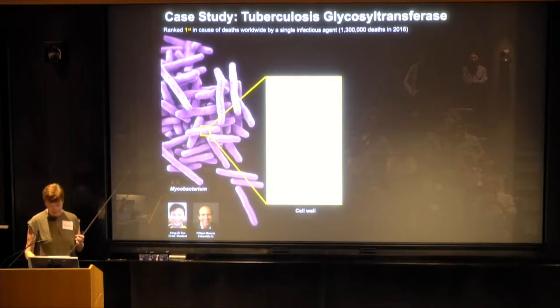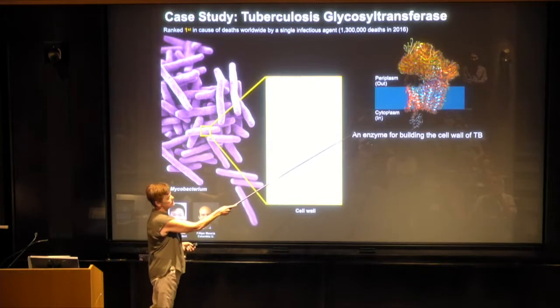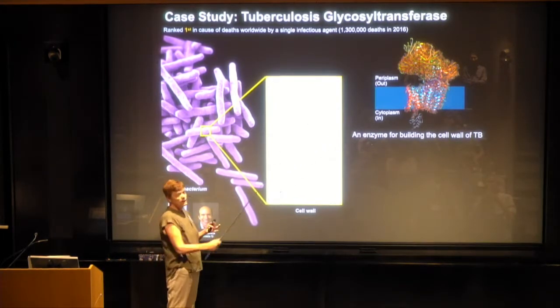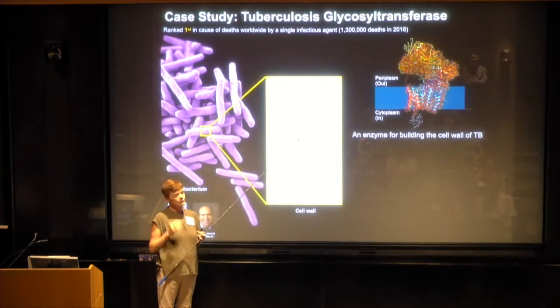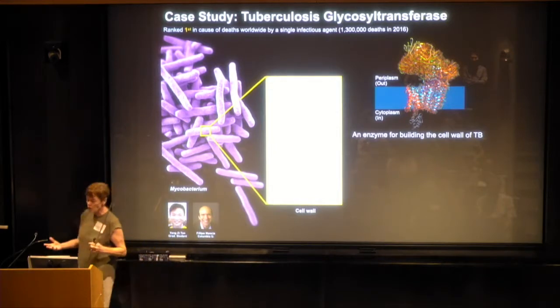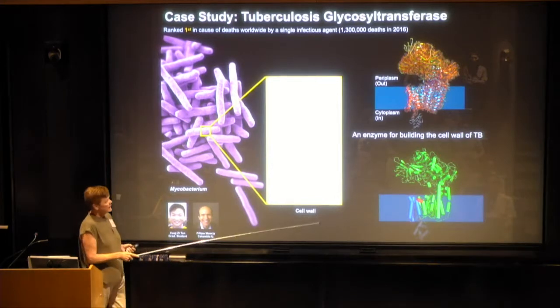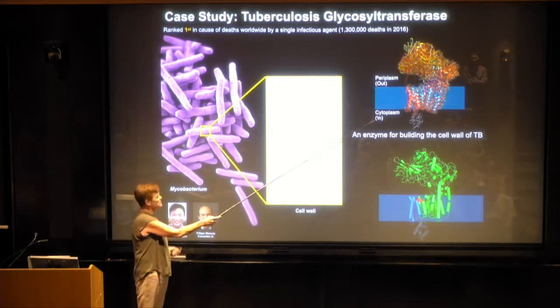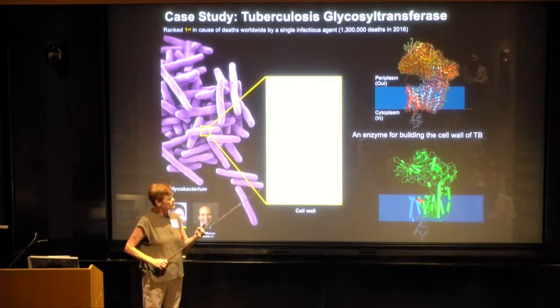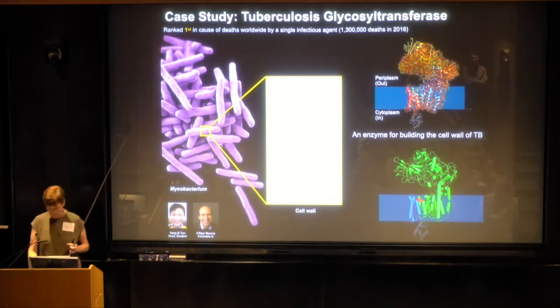between those lipid bilayers. And one of the machines that builds that cell wall is this thing here called AftD. If you can interfere with AftD, if you knock it out, the whole bacterium dies. So it's an essential molecule, and therefore it's a good target for drugging the bacterium. Yongzi did a whole bunch of different structures bound to ligands and various things, and that allowed him to say something about the mechanism of action of this molecular machine.